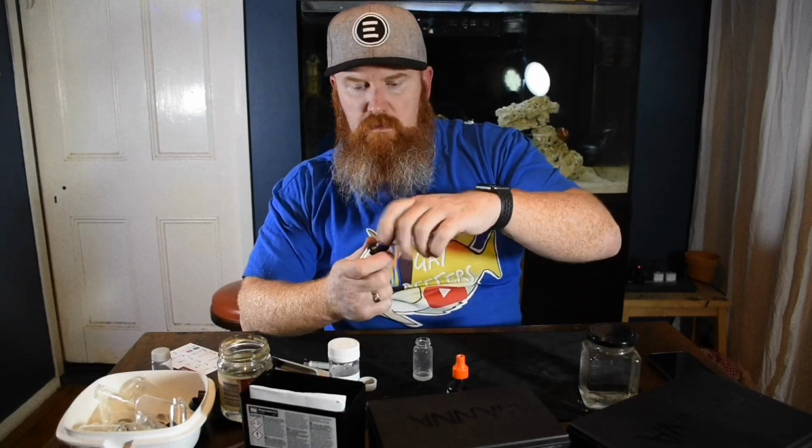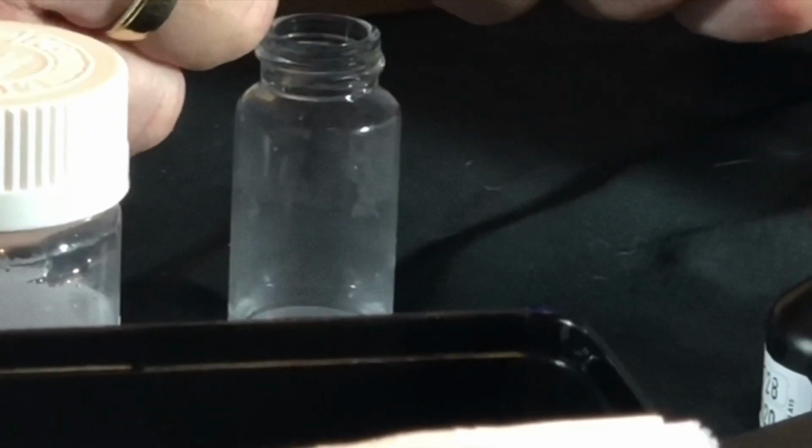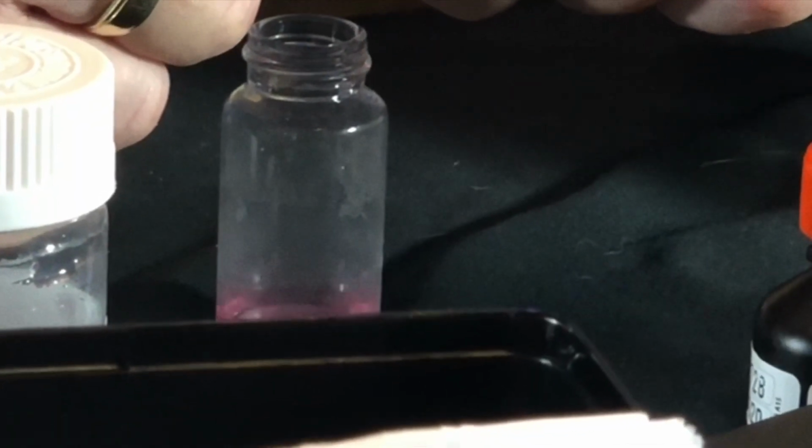All right, grab your reagent B, and you want to put 5 drops in. And shake for a minute or 60 seconds. Sometimes I need a second phone to do this, but Darren's recording on one, I'm timing on another one. So they just count.